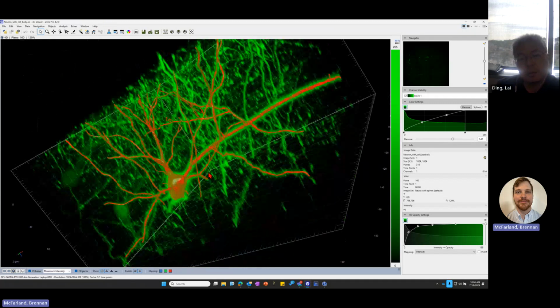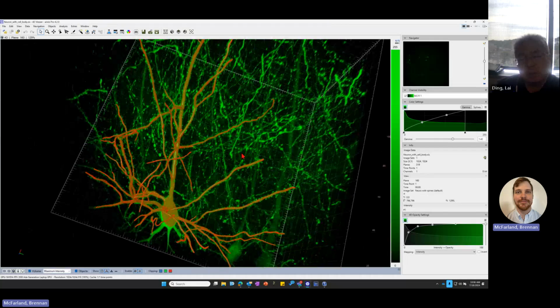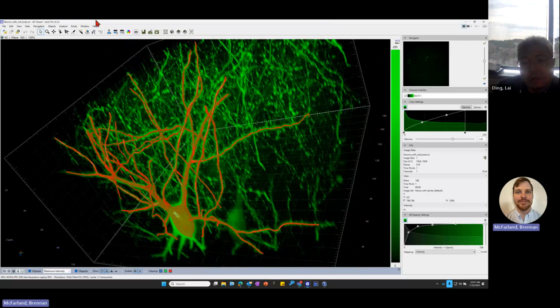The image that I'm using here is the one that we used last week for that neuron tracing. But the same kind of process is used for any image that you have within here. In order to access that movie making module, first we will go into this 4D viewer. And once we hit that, there's a couple of options that pop up. Right up here, these 3 different green looking icons. And I guess I'll also mention this one here too.